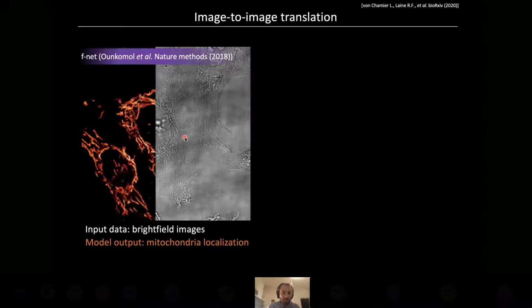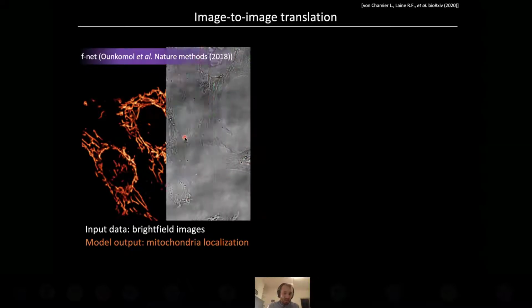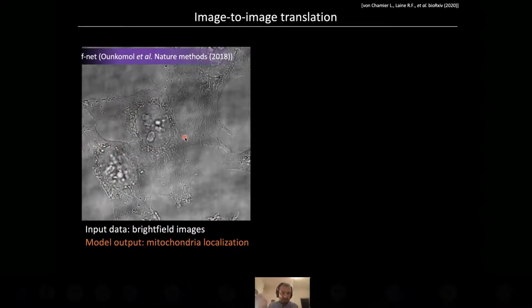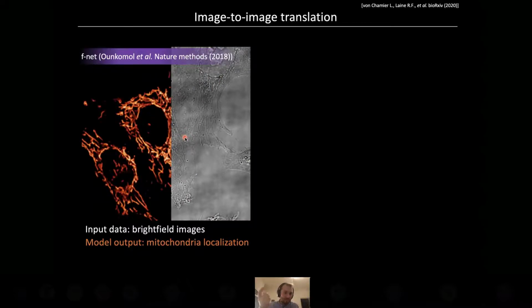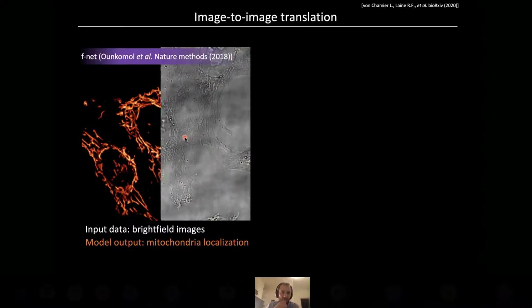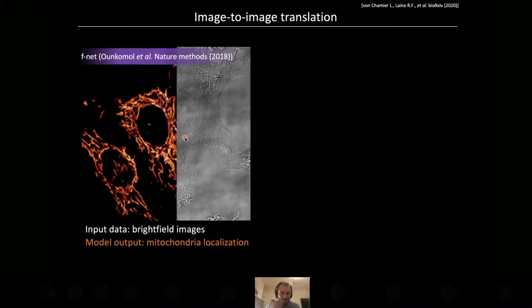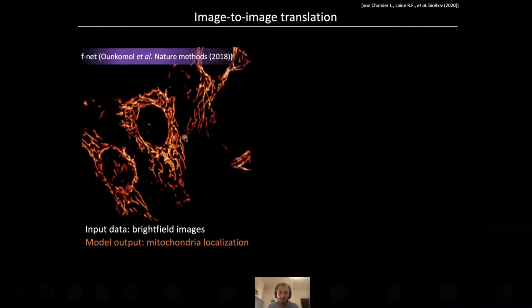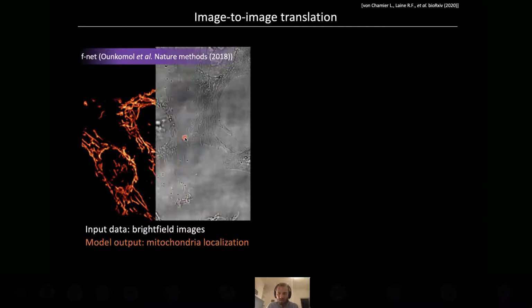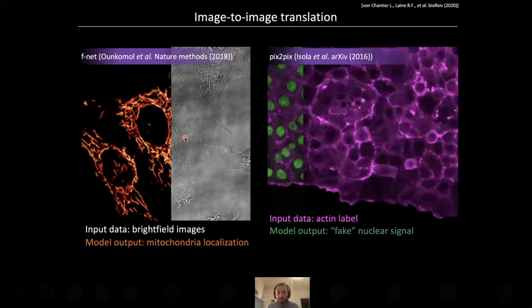An extremely powerful approach, in my opinion, where essentially chemically specific marking or labeling can be obtained from a label-free image, and so that can alleviate to some extent the need to even fluorescently label certain samples. So that's really quite a game changer in fluorescence microscopy and general microscopy in this particular case.